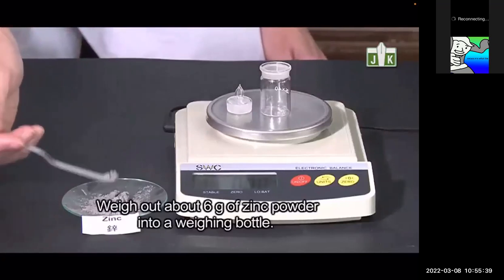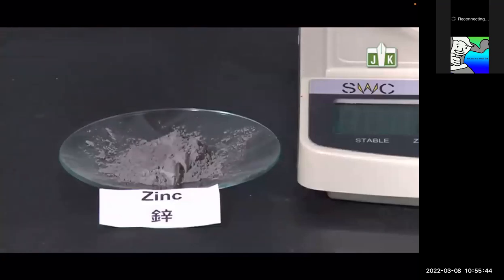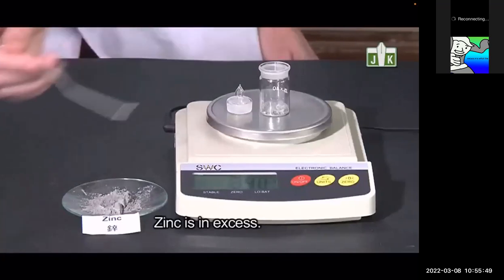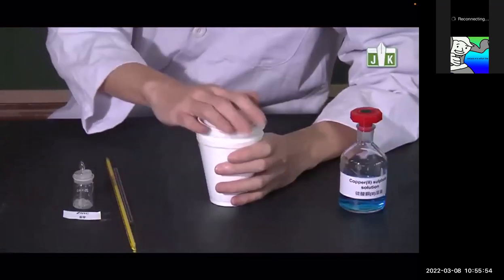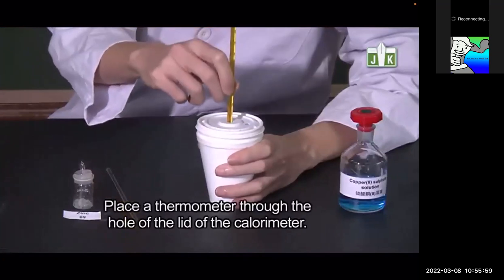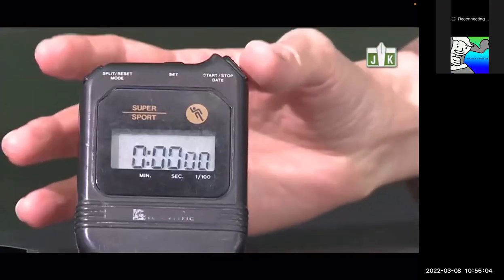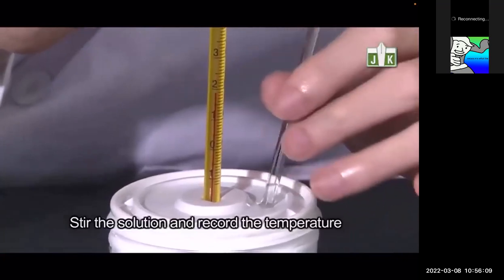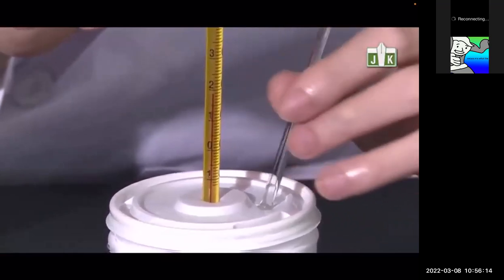Weigh out about 6 grams of zinc powder into a weighing bottle. Zinc is in excess. Place a thermometer through the hole of the lid of the calorimeter. Stir the solution and record the temperature every half minute for 2.5 minutes.